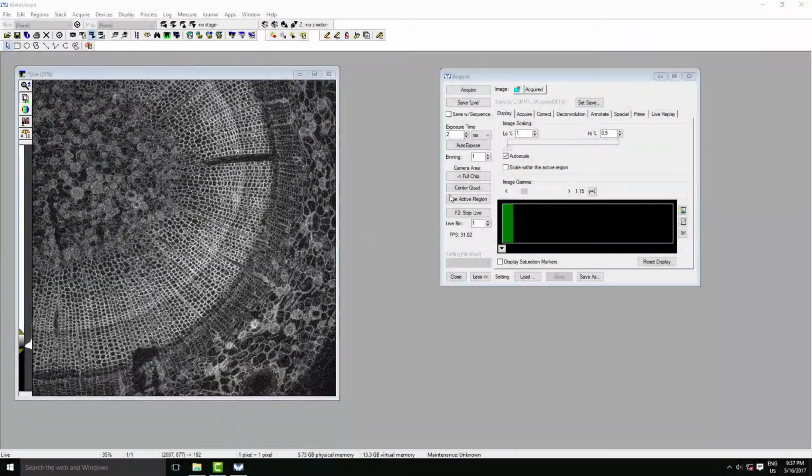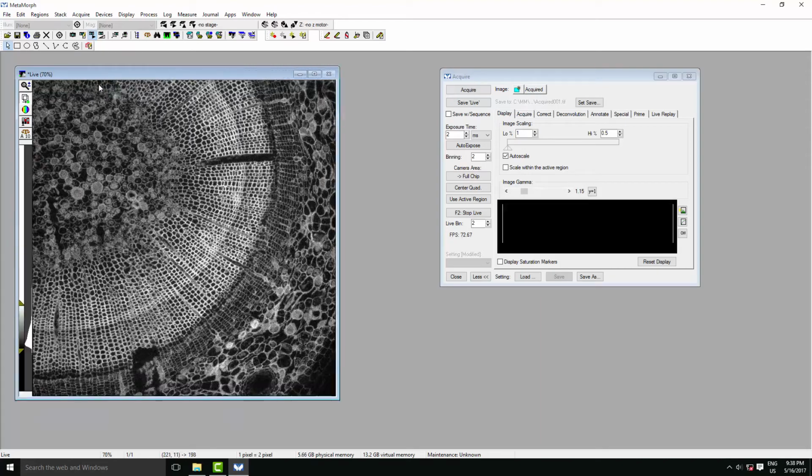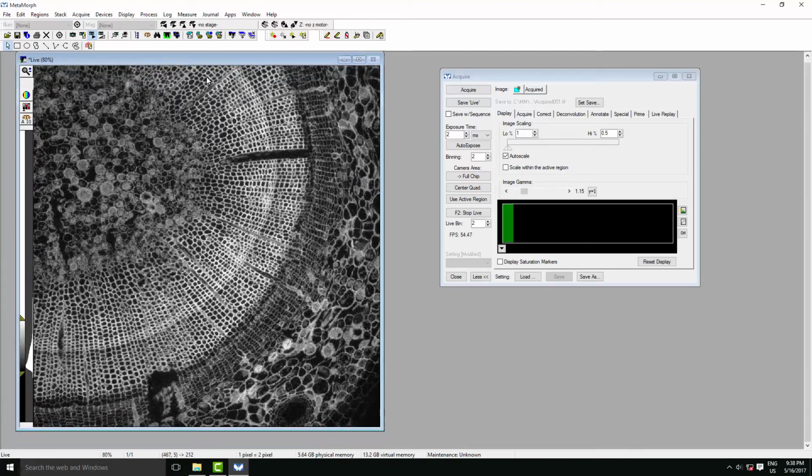Next we'll look at binning for if you need to increase your pixel size, increase your sensitivity, say at these low exposures. So it's very simple to change. Here just go from binning 1 to binning 2. And just quickly use the scroll wheel to get this window back to its original size. Here we have an image with slightly less resolution, but the signal to noise is better.